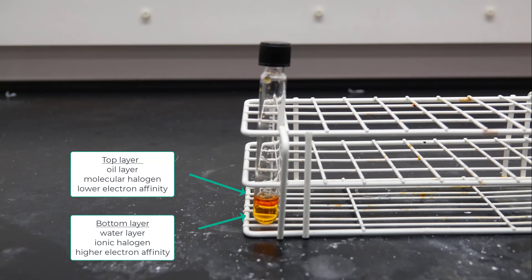After you've completed all your possible combinations, you should have six total combinations, six total test tubes. You don't have to combine, for example, molecular iodine with ionic iodine, you just need to combine the different halogens together. You should be able to draw conclusions about which one has the highest, the middle, and the lowest electron affinity for each of these elements.